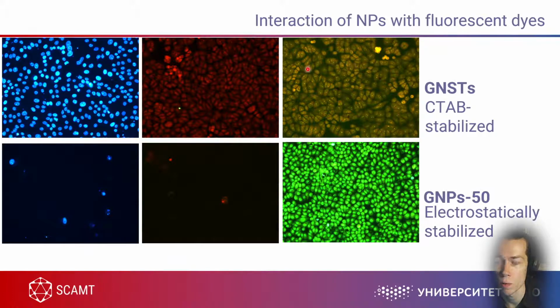Since some of the organelles are damaged here, probably some of the lysosomes are also damaged, and the pH inside the cells is more acidic than it should be. Because of this, we have a bit of red added to green. We have some brownish color here, probably.